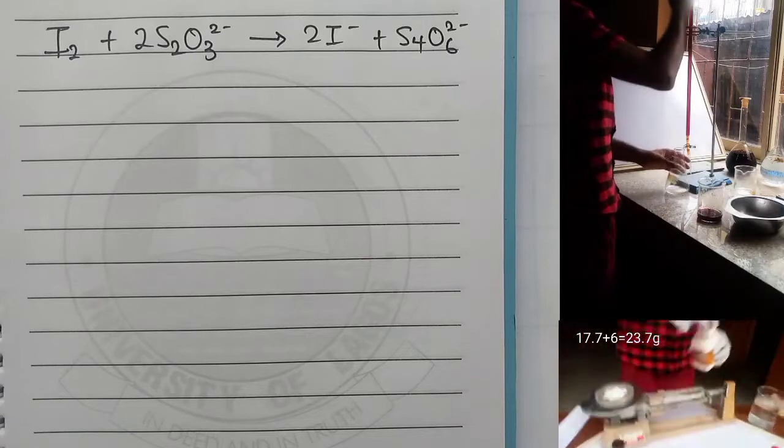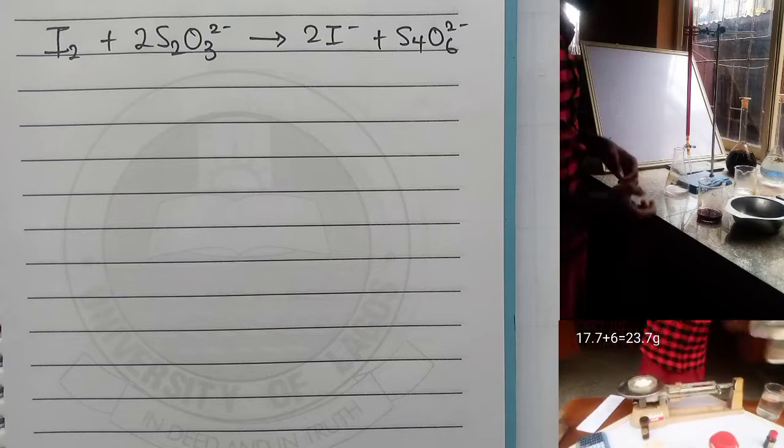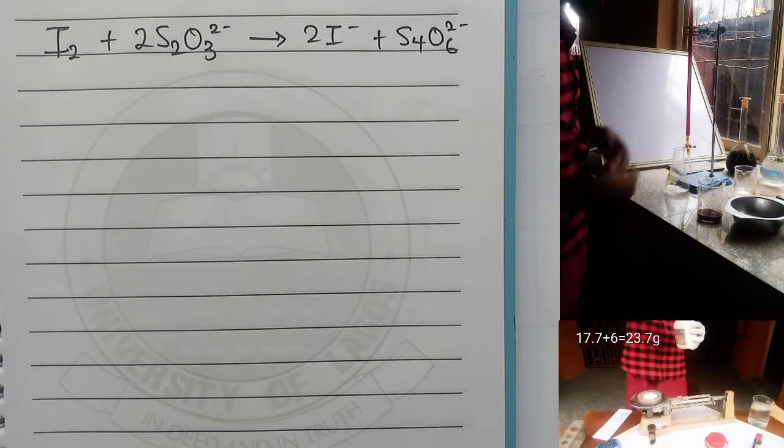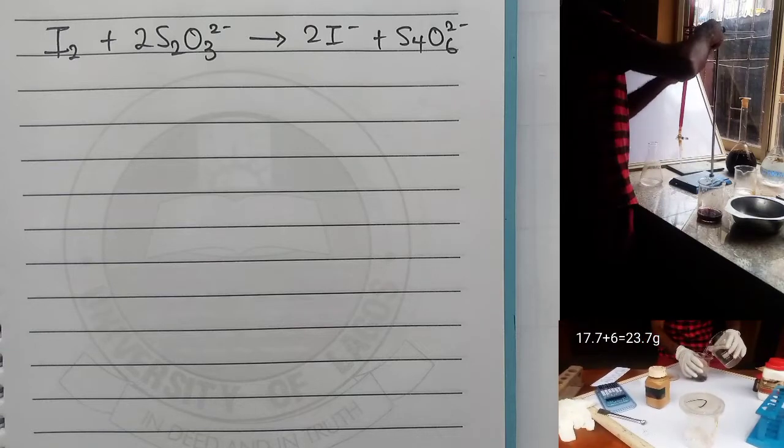The equation of the reaction is... I have something to say here, because while I was preparing the solution, I found it to be difficult work.